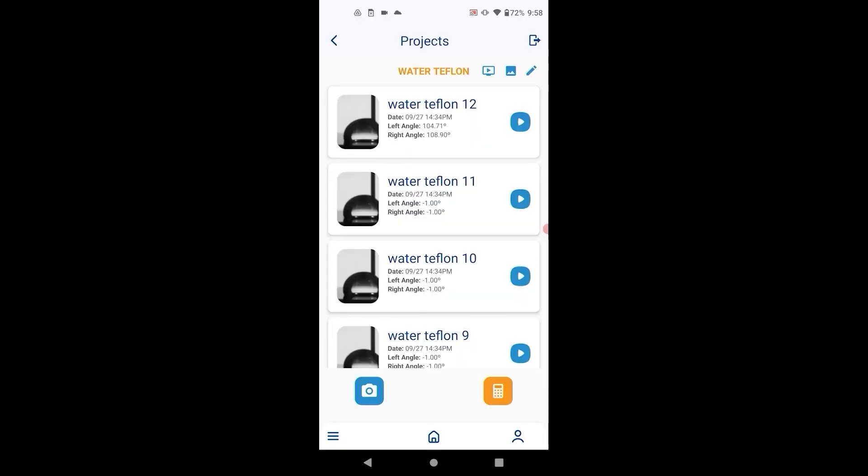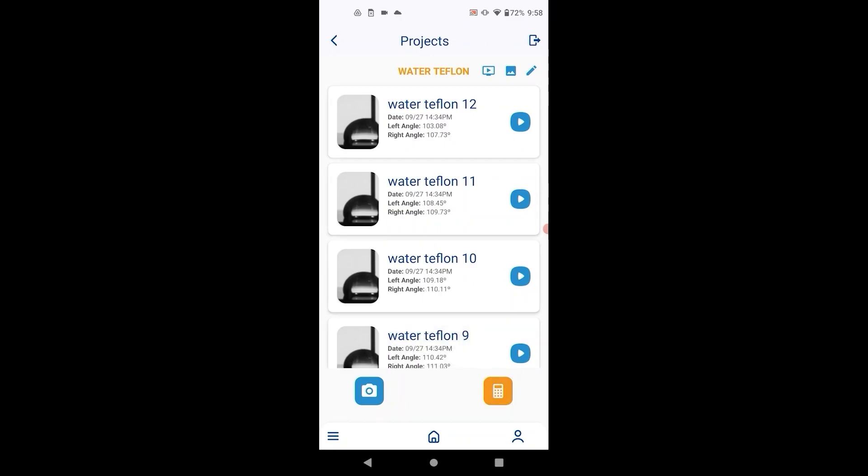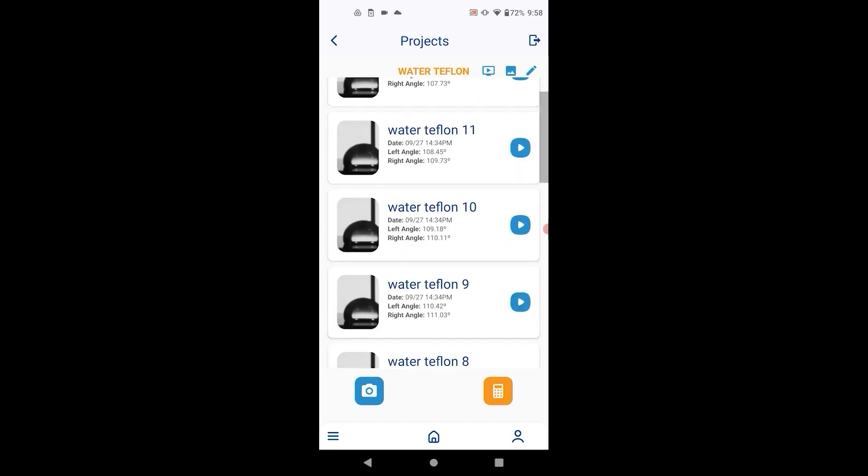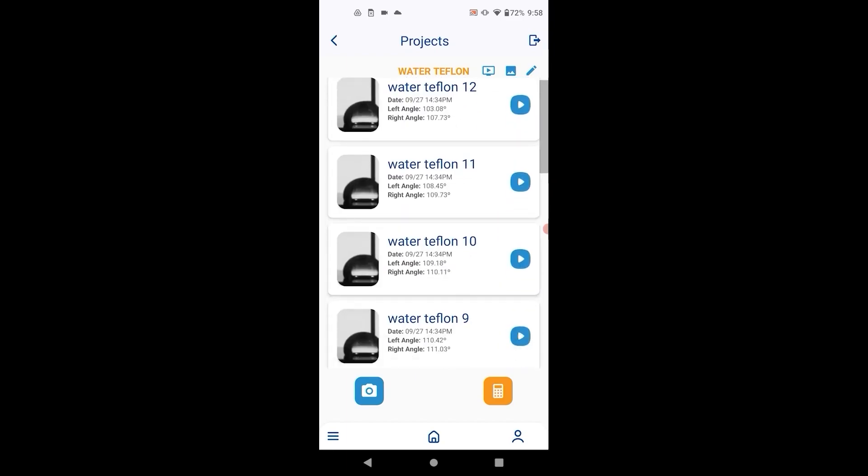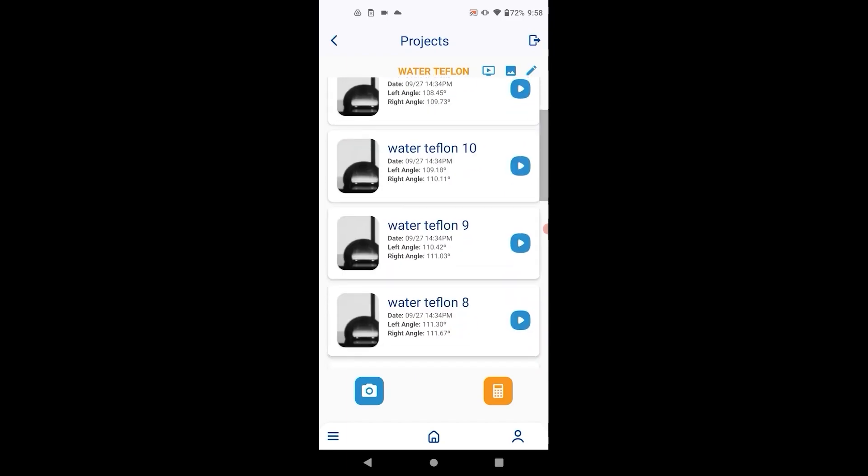Go to one of the images and do the entire calculation process, including calibration if using the Young-Laplace method. Then go back and hit calculate all to process all the images captured in this time frame.